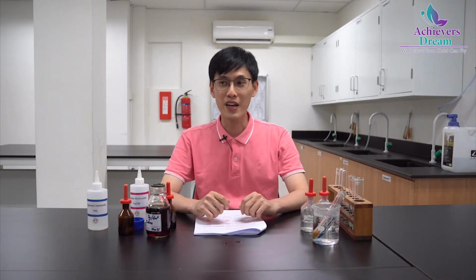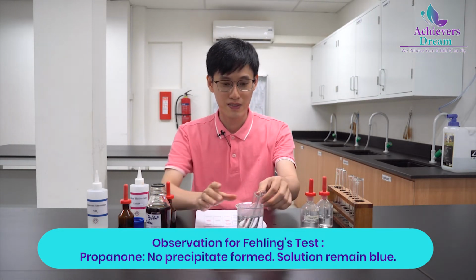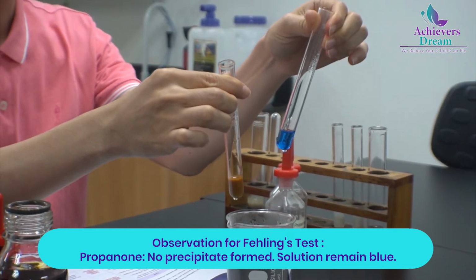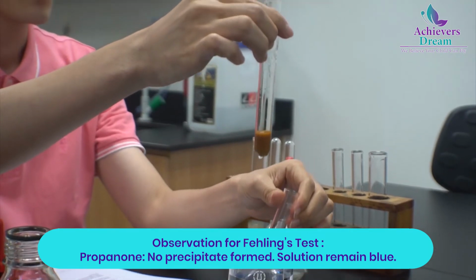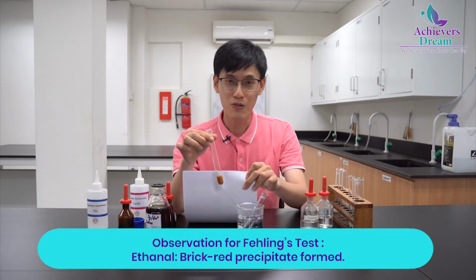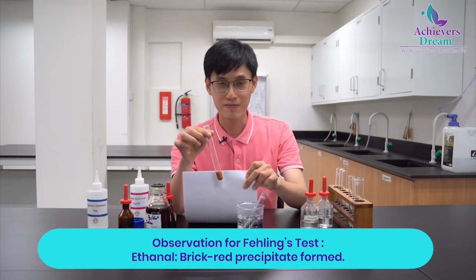Let's do a quick check on what we have for the Fehling's test. Let's look at the water bath. Wow. What we have on my left is the test tube containing propanone with Fehling's solution, and the test tube on my right. This is the brick-red precipitate that you are looking for when your aldehyde gets oxidized by Fehling's. This is the test tube that contains ethanal.